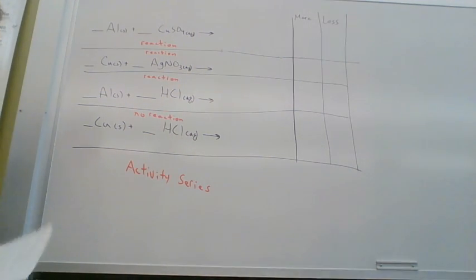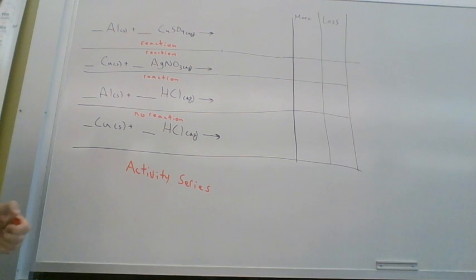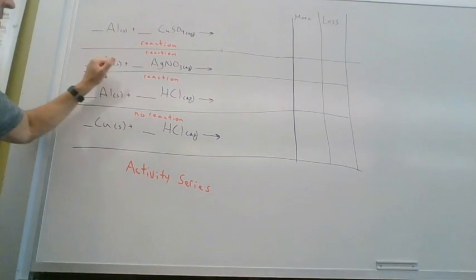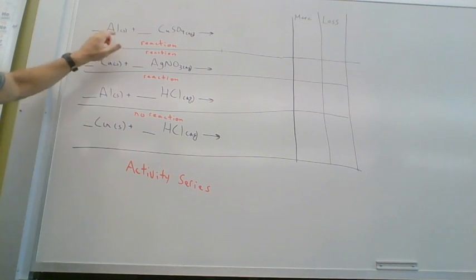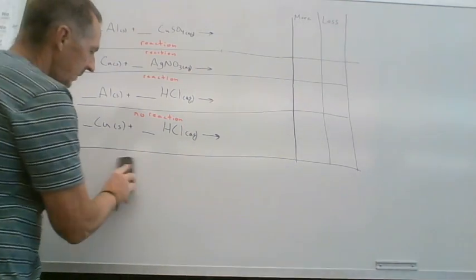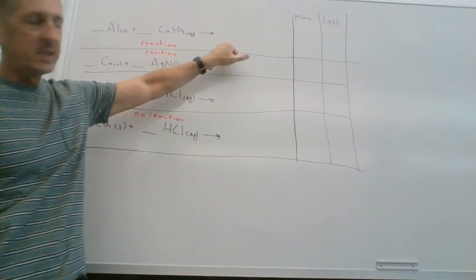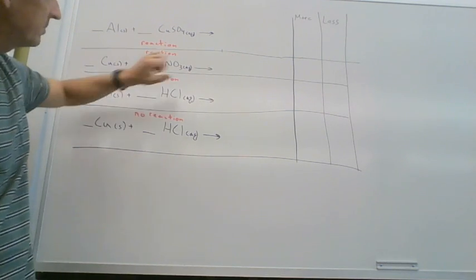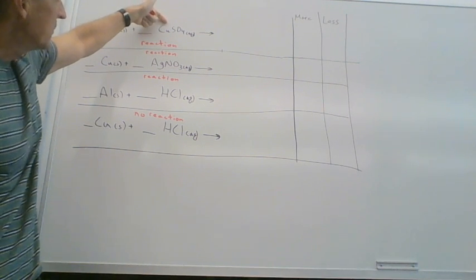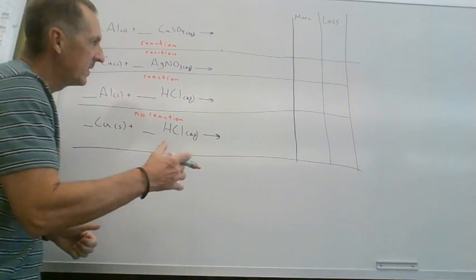So what we've collected so far, if you have a bunch of these equations and you have whether there was a reaction or not. If there was a reaction, that meant that the equation went forward, that something happened when we mixed this aluminum with copper sulfate. And what you're expected to do then in this lab is predict what the products of that single displacement reaction is. And in a single displacement, this aluminum is going to replace this other metal and now be with the sulfate.